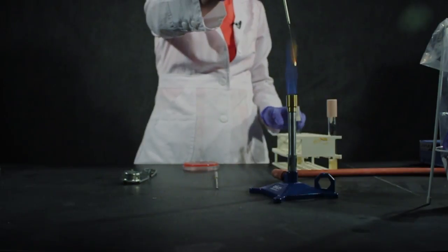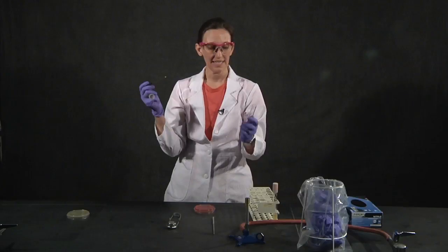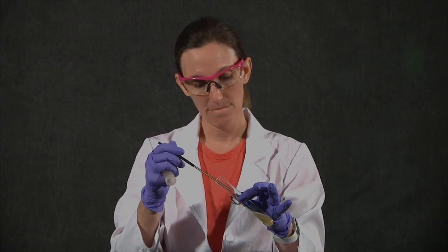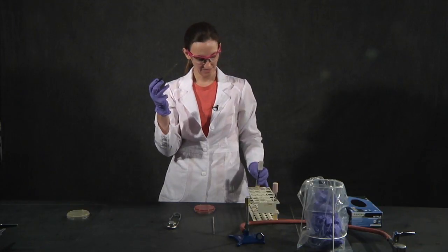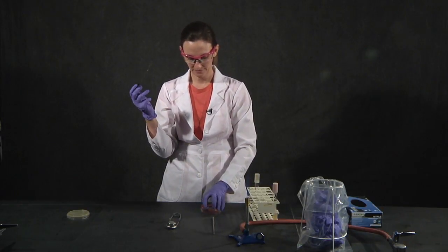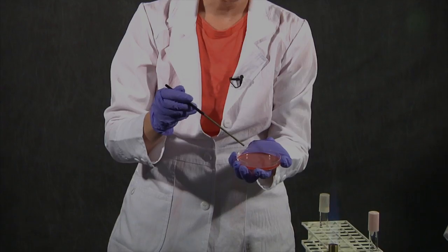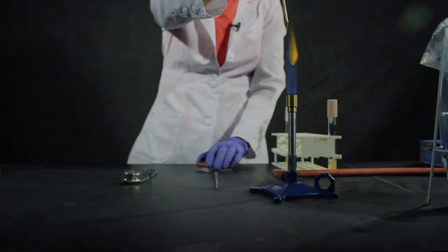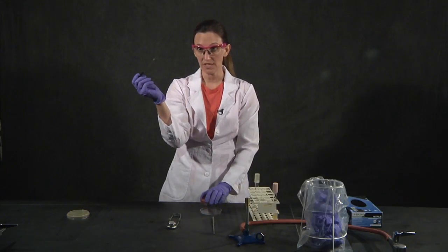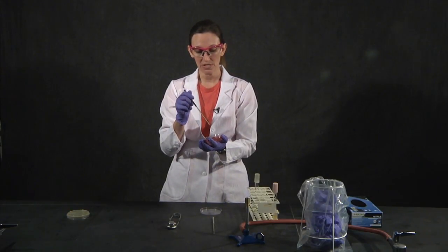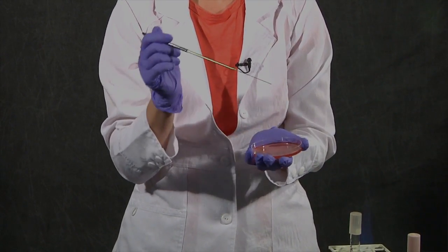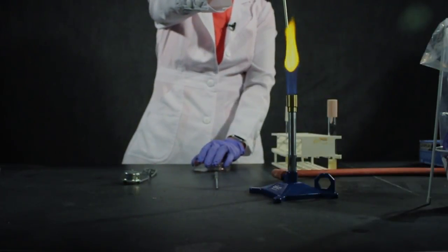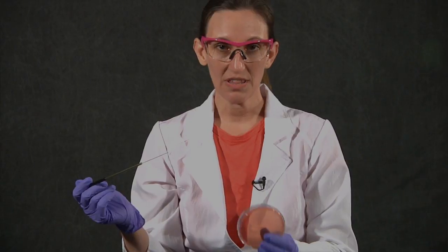I'm going to sterilize my loop and take the sample from the working stock. Place a little bit of the inoculum there, and then make sure you are streaking for isolation by reducing the number of organisms overlapping — streaking. You're going to incubate the MacConkey plate for 24 hours at your optimal growth temperature.